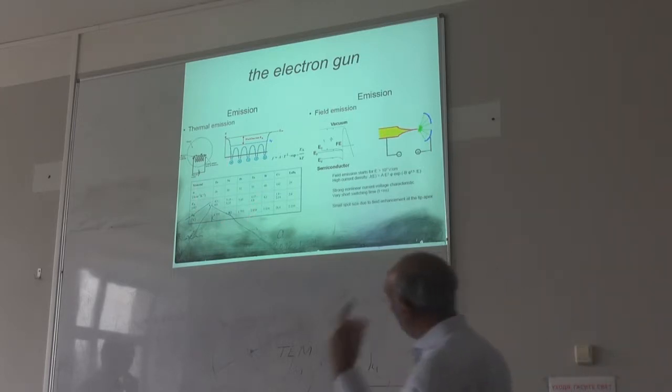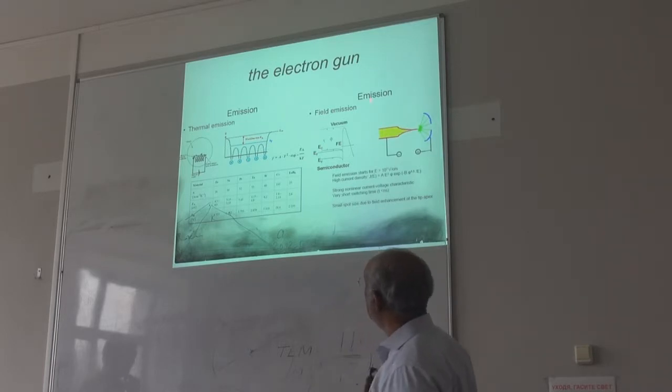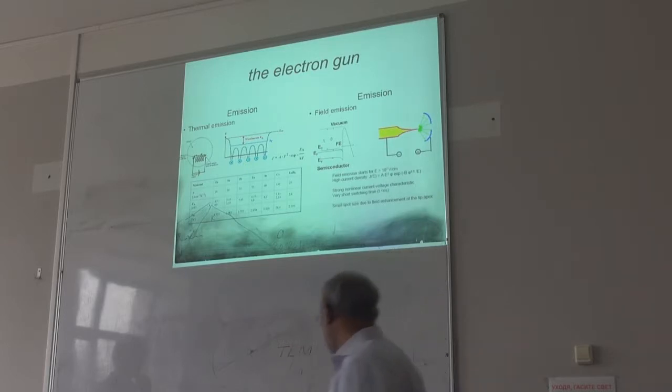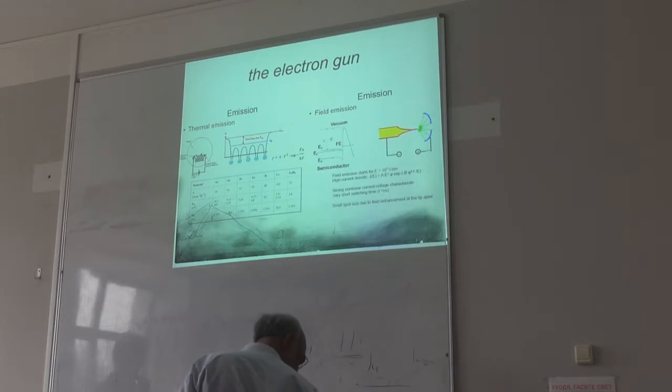Long time ago, most of the electron microscopes used thermionic emission. Field emission is where you have to apply a very large voltage, like kilovolts, then you can emit electrons. So, if you have the first one, use this.